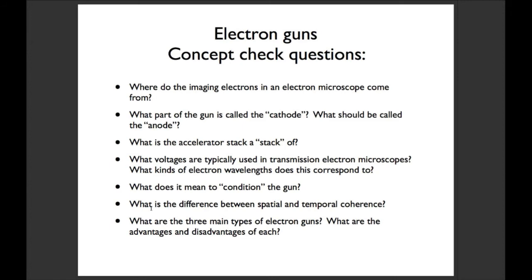Typical voltages used for TEMs: we have anything from 80 kV, 120 kV, 200 kV, and 300 kV. I don't think that there's anything outside of those. Youngsi? I think there is one higher, like a 500 kV, or a million volt, 1,000 kV. Extremely unstable. Oh wow, I did not know. I've never even heard of that.